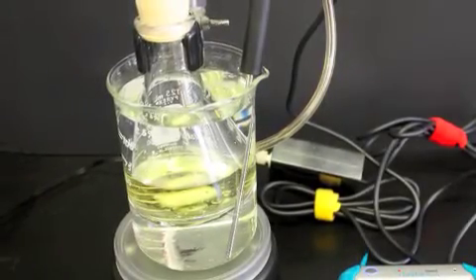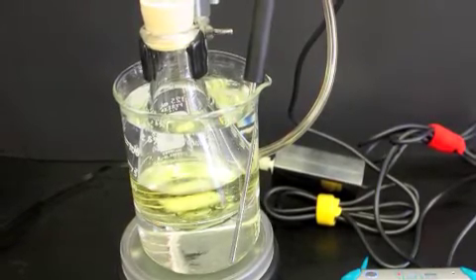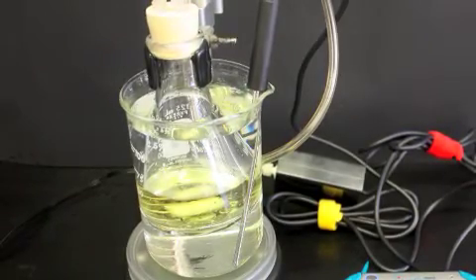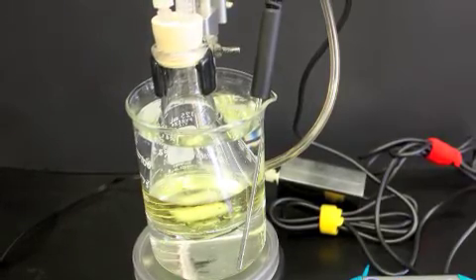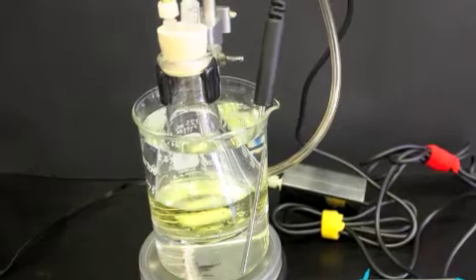You're going to use the same method of data collection for your other trials using various amounts and concentrations of reactants. So what you need to do is dump out your reaction chamber, rinse it with water, dry it as best you can, and then we're going to repeat the process with your other trials.